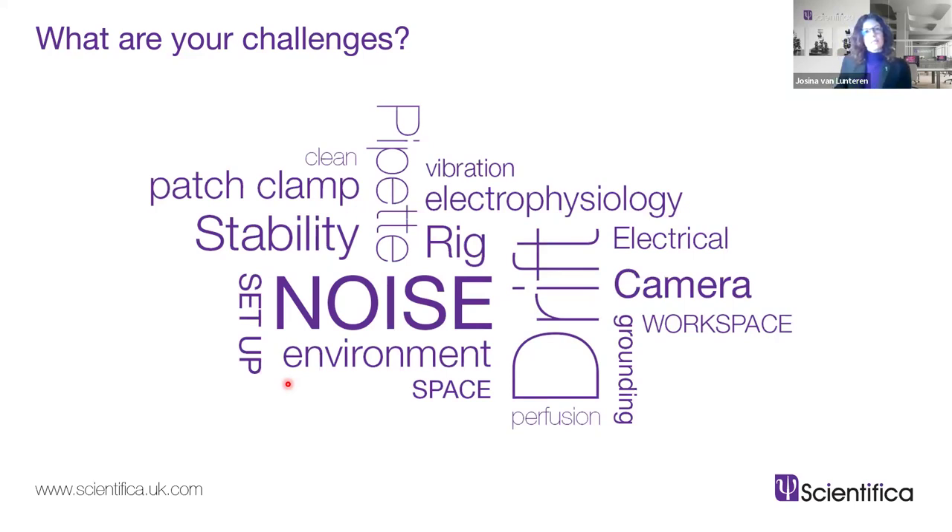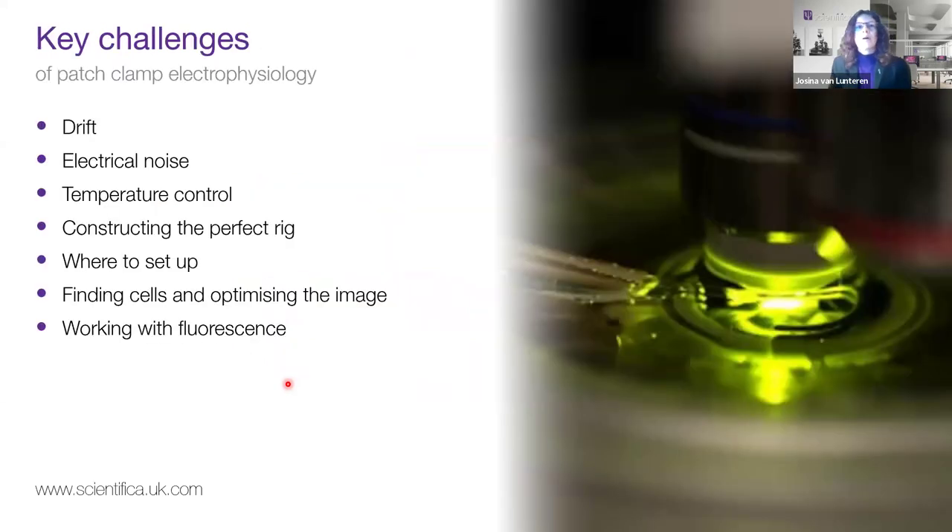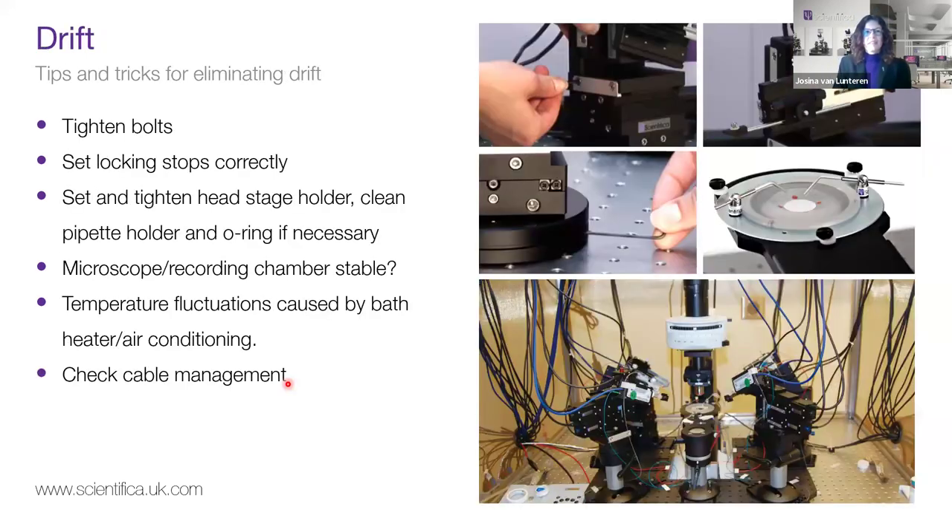Today we'll look at some more persistent challenges that you have to solve on your rig. We'll look at drift, electrical noise, temperature control, tips on setting up your rig in the right place, finding the right cells and getting a nice image, and finding cells with fluorescence. First, drift. Scientifica manipulators are made not to drift, but if you find your pipette is drifting there are some things you can try. Drift means you see your pipette move in relation to your microscope when you're looking through it — these precision instruments should stay still once you stop moving the wheels.